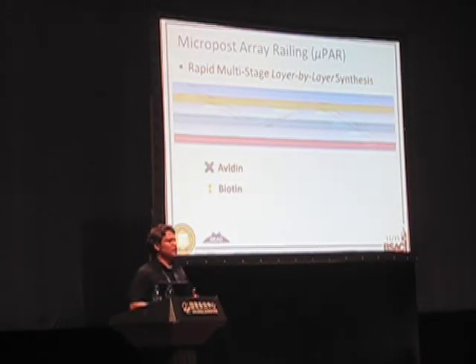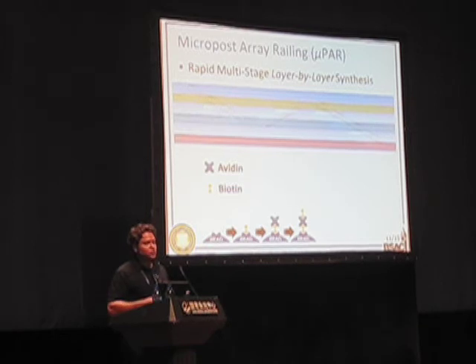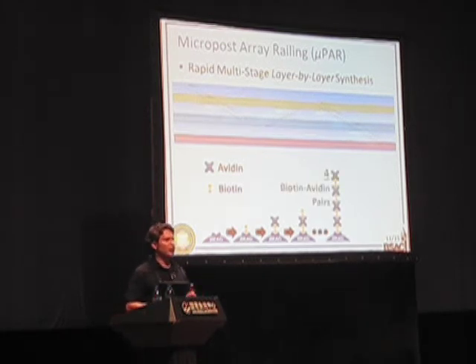By railing the microbeads into all these different solutions, we were able to add biotin molecules and avidin molecules layer by layer by layer. In our actual system, we repeated this several times so that by the end of the process, we'd actually achieved a microbead with 4 biotin-avidin pairs bound to the surface of the microbead.